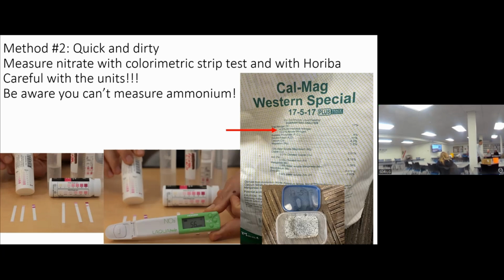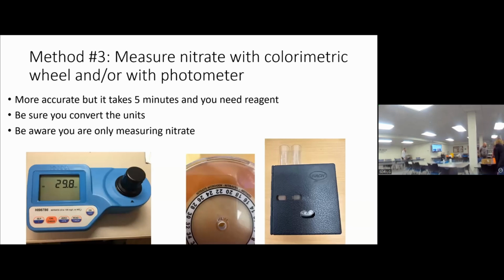So who are the twos? Whoever are the twos, come to this table, and you have some water there, and you have some calcium nitrate. You can measure the nitrate in the water by itself, then you can add the calcium nitrate, and you convince yourself that the thing changes color. Does it make sense? And now that you have learned how to use these tools, later you can use it for your orchard or for your nursery or whatever you grow.